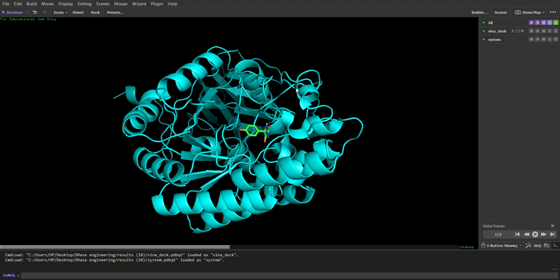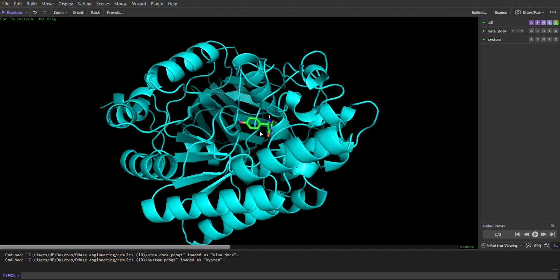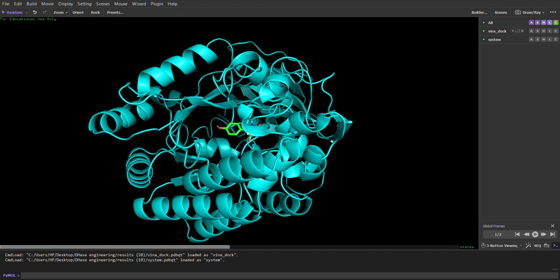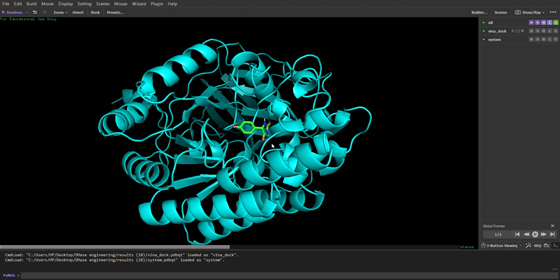What we can do next is try to understand more about the binding cavity, and which side binds. Ideally the side where the reaction takes place is the hydantoin side, the hydantoin ring. Okay, this ring, yes, is where the reaction takes place.